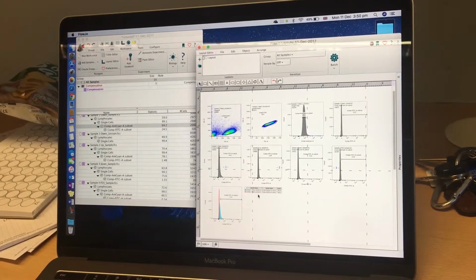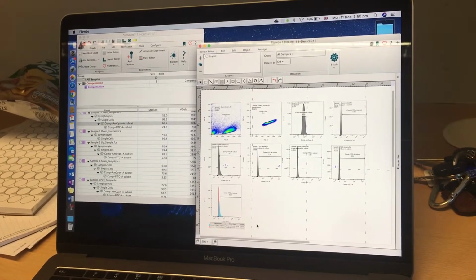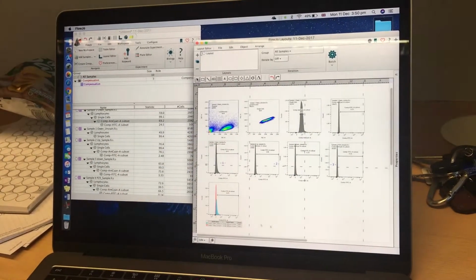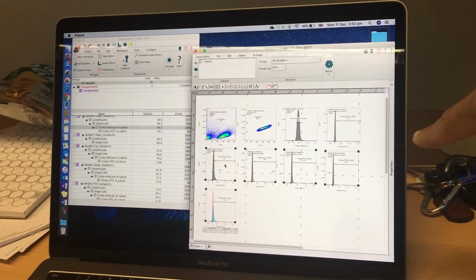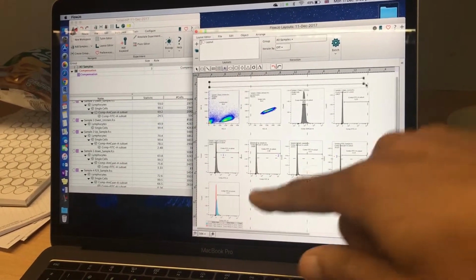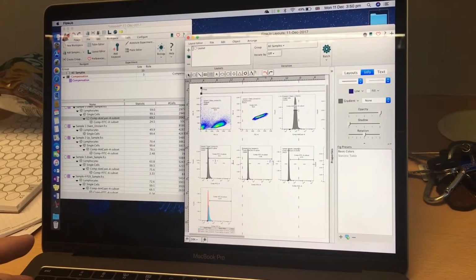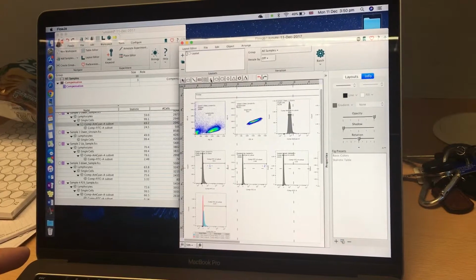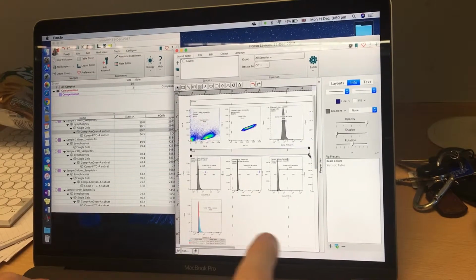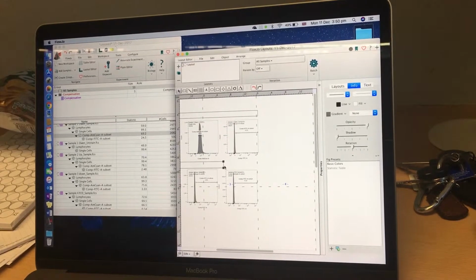That's really fantastic. It's much easier to use like that. It's easier for people to see. Because if I look at that, I'm like, what is going on? But if I look at this, you can see. So put strategy results above each one. How I gated the unstained and the live dead and the isotype, and the result, the overlapping. So strategy, and then just make it go across the page.